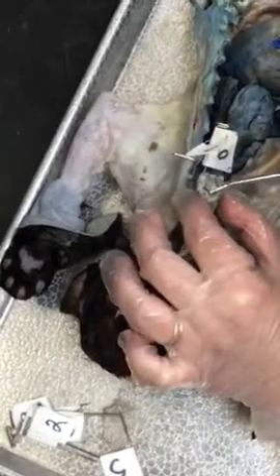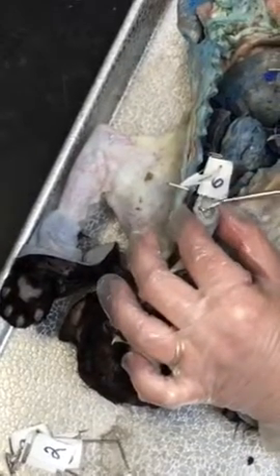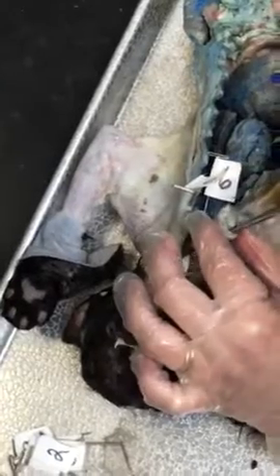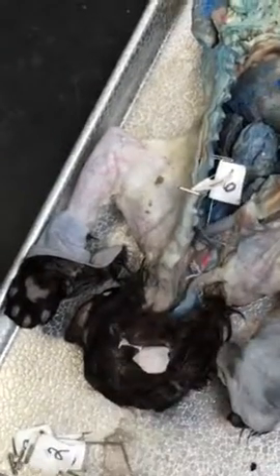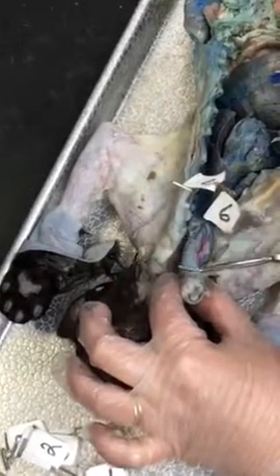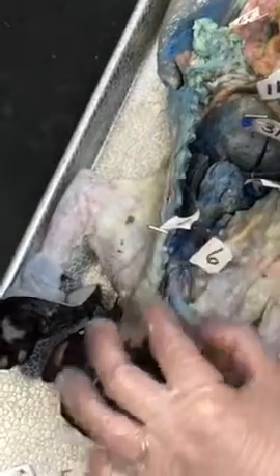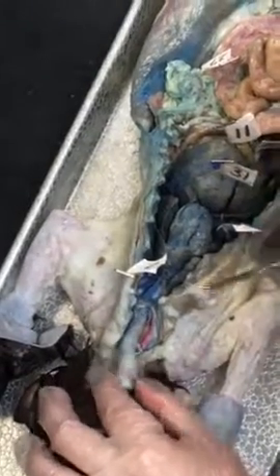we see the epiglottis right there, the little tongue flap. All right, so when you swallow, that closes down over your trachea, so the food goes down into the esophagus, which is this tube running behind the trachea. This front is the trachea, the bendy straw. You can feel the ridges in it as you go down. Somebody got a little excessive in dissecting here.